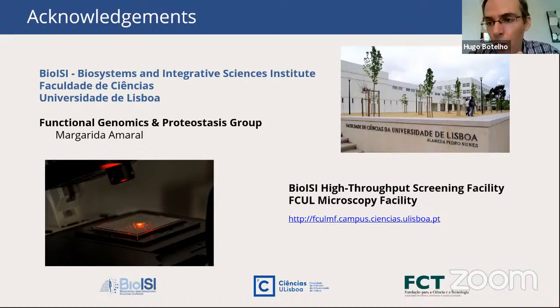Okay, so the first question is which software is used for analysis. It depends on the application and your skill and also your preference. We are big fans of open source software. So we either use ImageJ or CellProfiler. CellProfiler is an open source software which can perform batch image analysis really easily using similar operations as you would in ImageJ. But if you have the skills either yourself or at your facility, you can of course devise a script in Python or MATLAB or using any other tool that you would like. So everything which may work can be used.